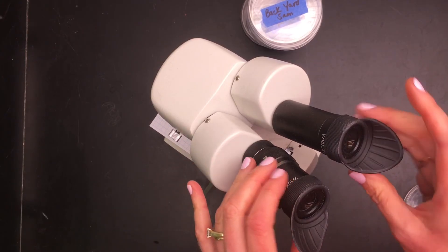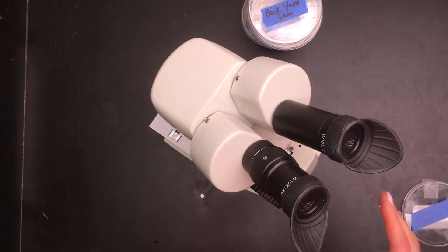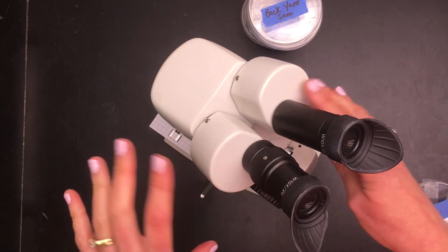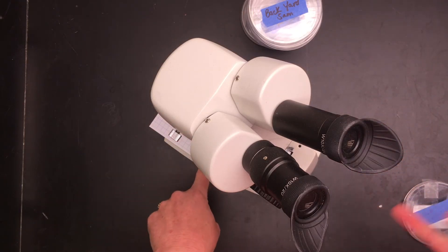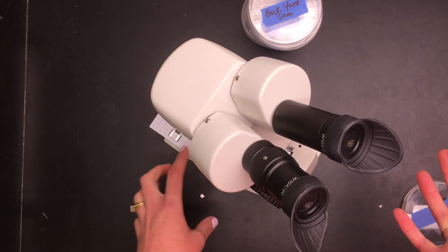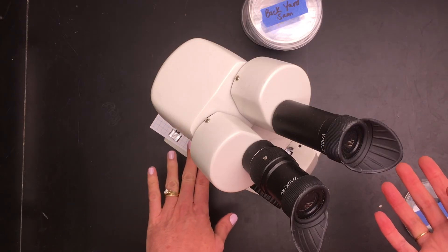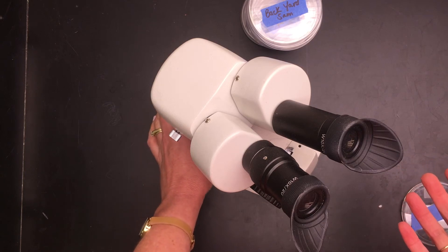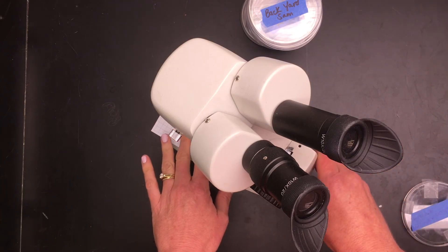You can take the numbers of particulates. Your group could decide if it wants to measure the size of the particulates, and you guys can decide what small, medium, and large means. You also need to take note of some qualitative data like the color perhaps. You may have a lot of fibers that are pink or blue, which could be from fabric. Some of you may have a lot of dog hairs or cat hairs, and that is something that you would see in your dish.